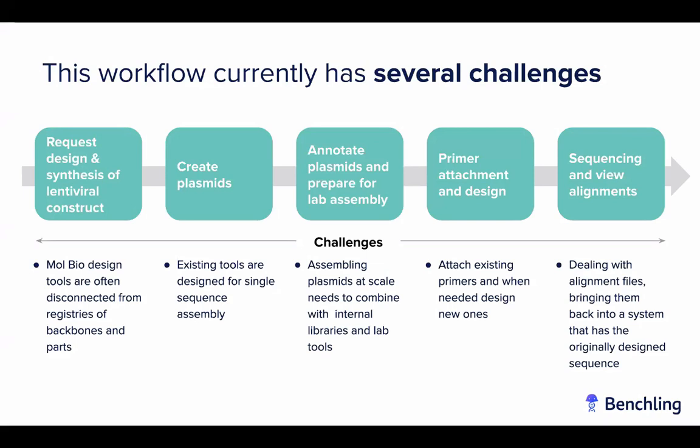So for another question, I'm curious, which of these challenges do you currently identify with based on the tools that you're using? And that will help Damien as he walks through the demo to emphasize certain parts of our tool. Great. Thank you so much.